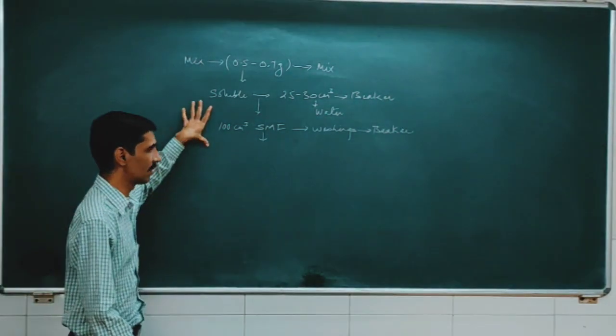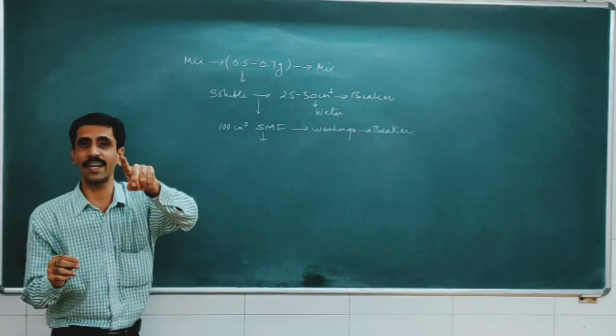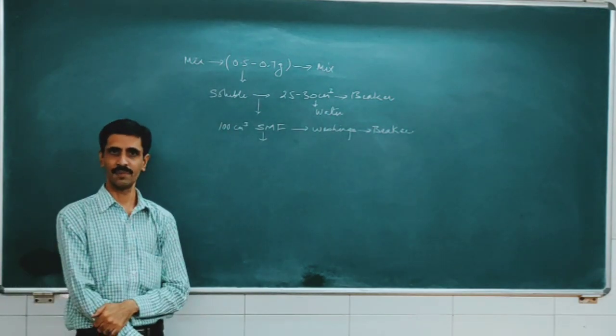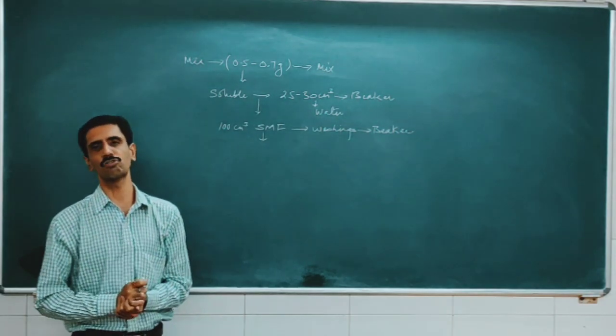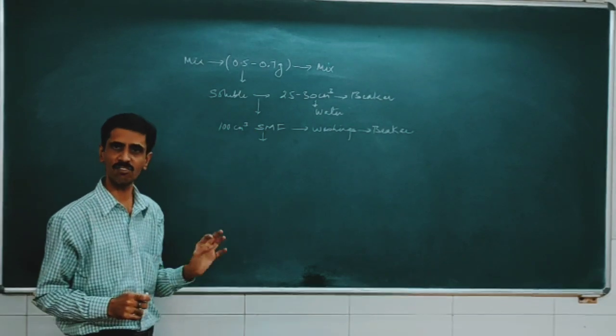So this is what we have, a solution of the cation. Which cation am I talking about? Yes, it's nickel 2. My dear friends, it is a titration. When you talk about titration, we require two solutions. One solution is ready, which is in the standard measuring flask.